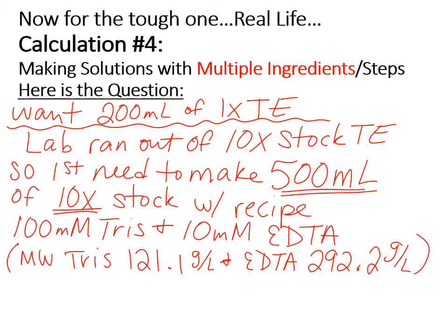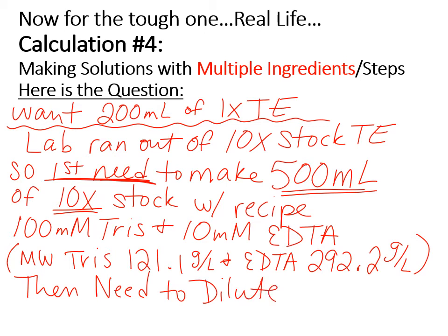Okay, once you make that, notice I said first you need to make the stock, then you need to dilute to make your ultimate 200 ml of 1x TE.